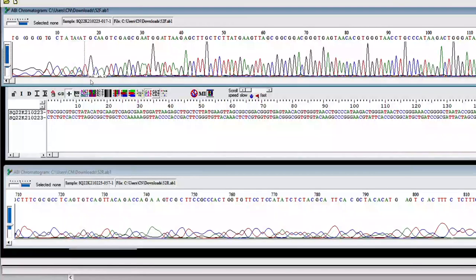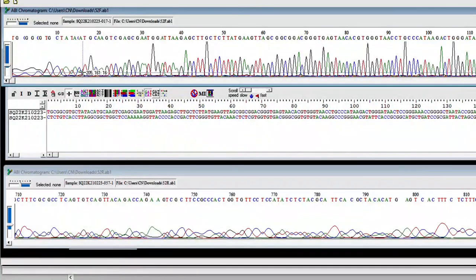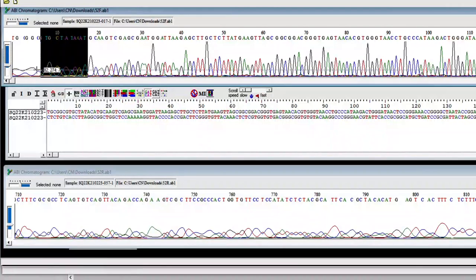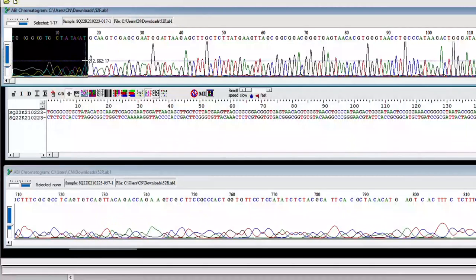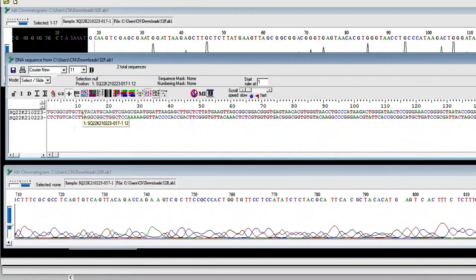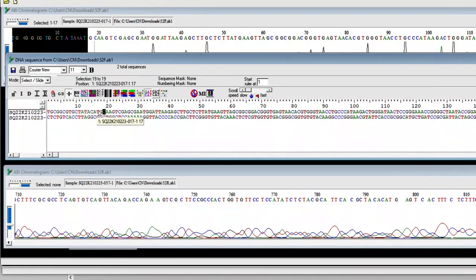We can see that from this region, the sequence is coming better and better, but from here the bands are not as sharp as in the middle region. So I can choose to begin from here where the picture is becoming better. So I know that from nucleotide number 17, I will chip it off. If we come here to position 17, which is T, this one — we have done this in editing mode.